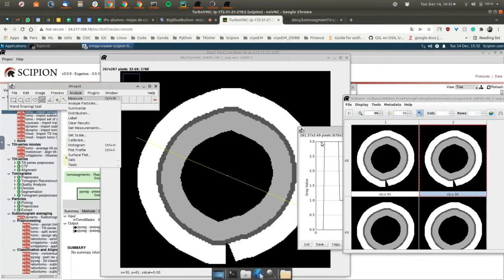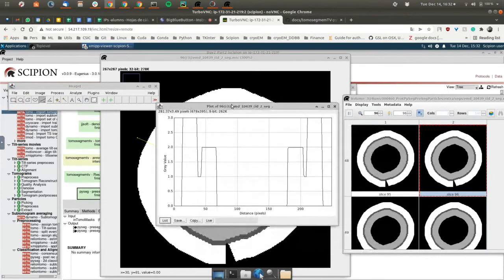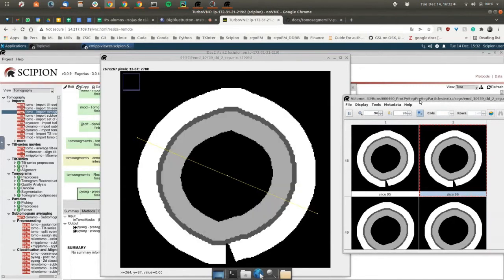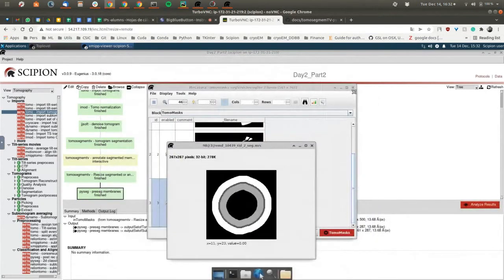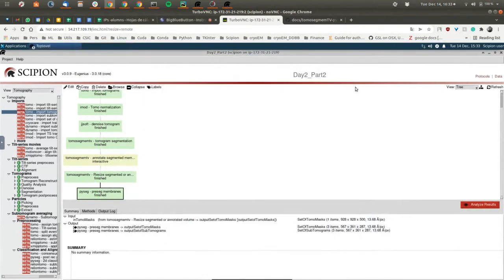Okay, now you have got it. Nice, Dimitri. Thanks for the question. So now we are sure, and this is to provide a clear visualization and conceptual understanding of how it works. Now we are ready to move to the graphs protocol.